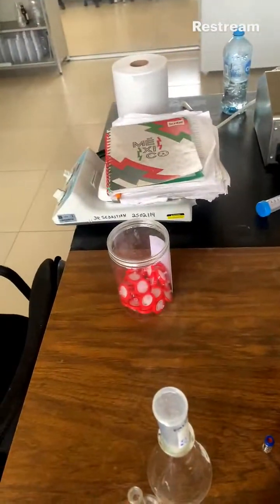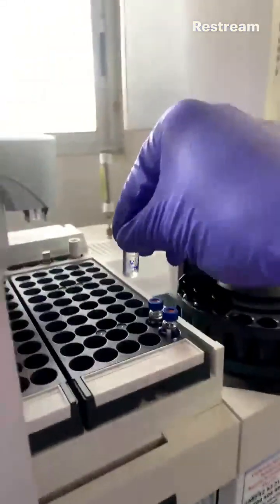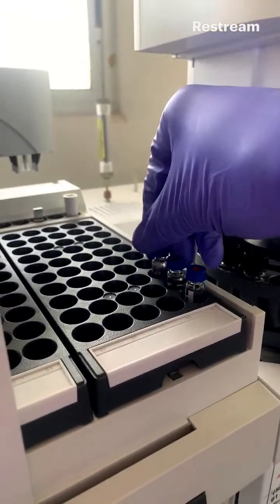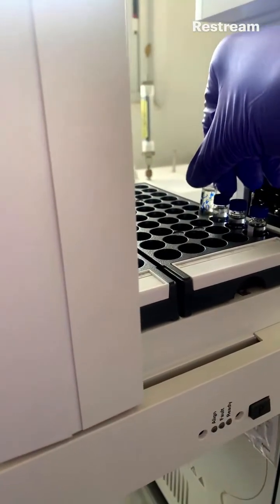I'll place it in port 2. Now this is GC banana. I'll place it in port 3. This is GC agave. I'll place it in port 4.